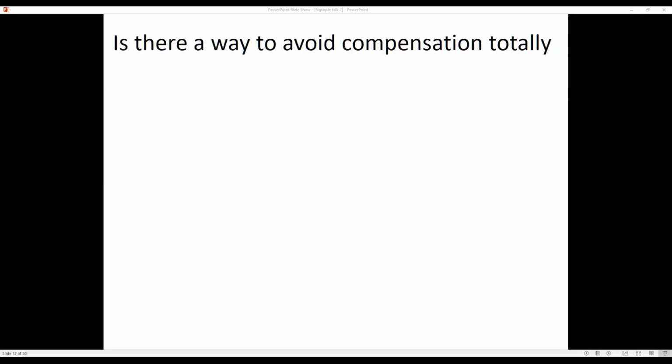So any other ways of doing it? There's a chat box comment by Dr. Gautam Bhagat: titration. If we have pre-saved comp files, then we can avoid it for further case analysis. Titration is something you need to remember is related to the volume of the antibody. Still, there is a spectral overlap happening. Remember, titration is only setting the amount of antibody volume to be used, so that you don't have a background signal, right?